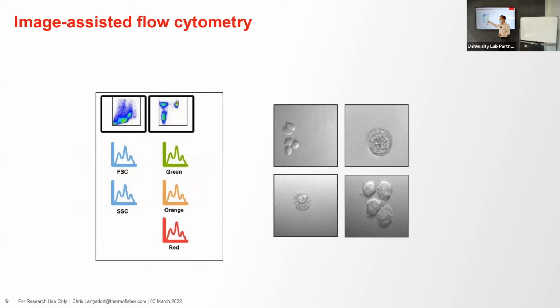So to the right are brighter cells, to the left are dimmer cells. And this is like a game of Connect 4 or Plinko, where you put cells into buckets, or we call them bins, and this line will get taller as more cells have a given brightness, right? And so these are our fluorescence histograms.